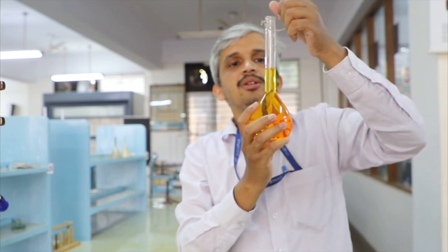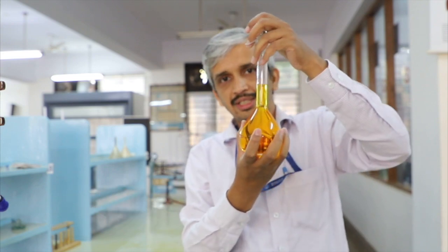So what care should be taken here is, one, the addition of the last portion of the standard flask should be done carefully using a burette. Okay, and you have to avoid parallax error. Therefore, you have to see the lower meniscus of the solution at your eye level. These are the two errors that should be avoided. If it crosses this 250 ml mark, then you have to repeat the process. Therefore, you should be very careful in this process.